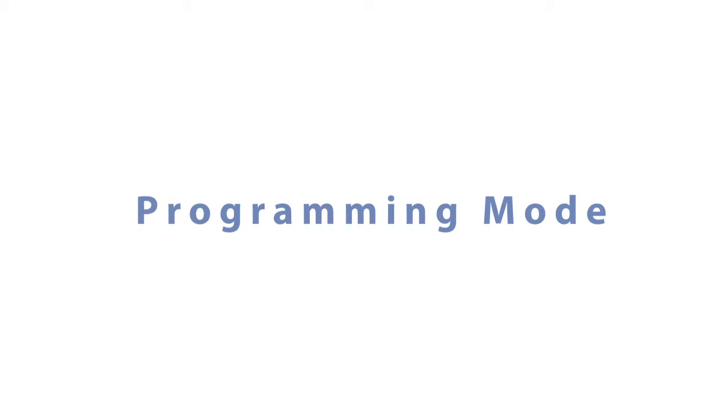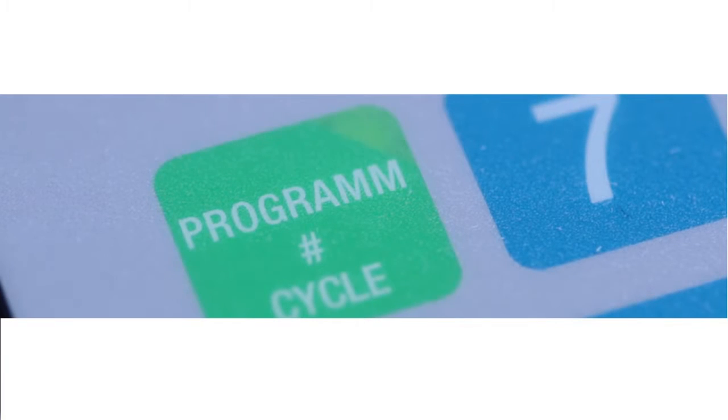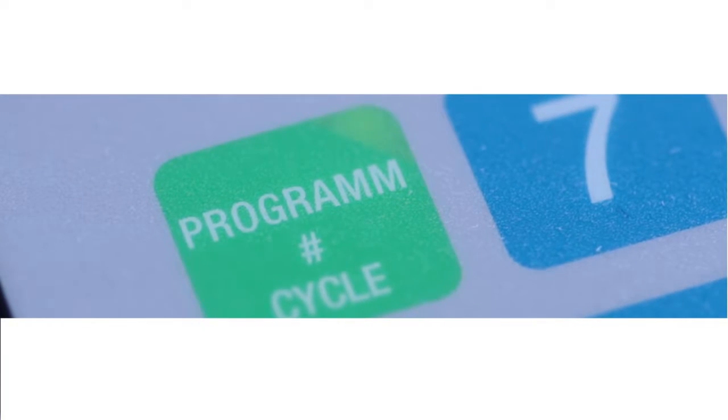To enter the programming mode, you must first ensure that the program button on the top left is not lit. Otherwise, press once to turn it off.